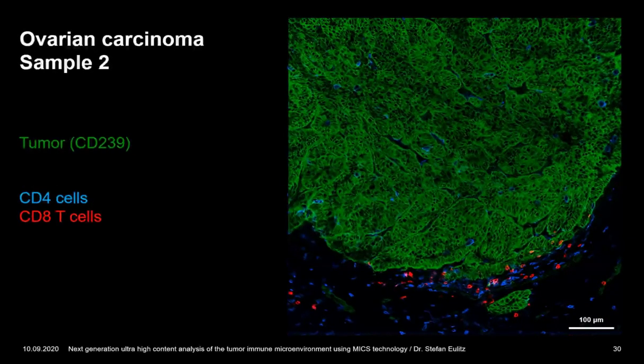So when we take a closer look at the T cell populations and their localization, it is even more obvious that cytotoxic T cells are not in the tumor, but stuck in the tumor margin, indicated by the CD8 staining in red. The few CD3 positive signals within the tumor core are only CD4 positive.